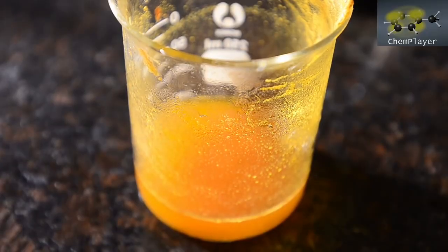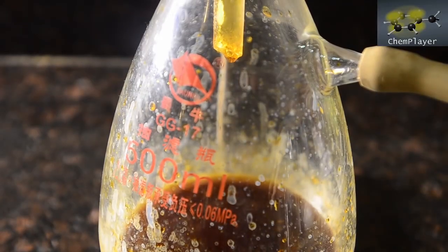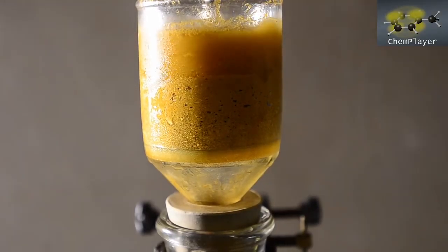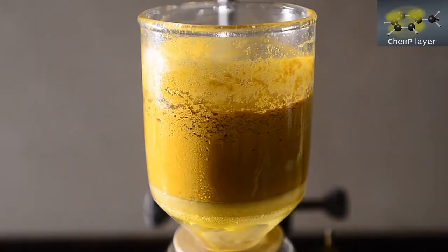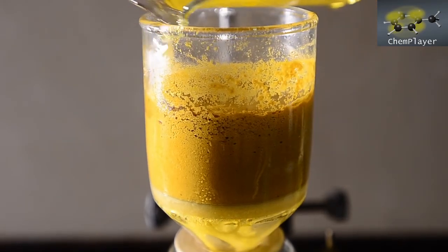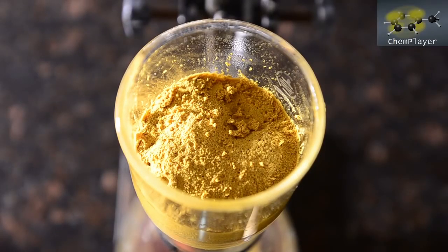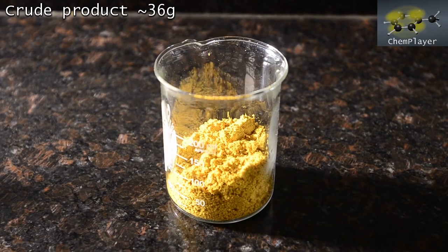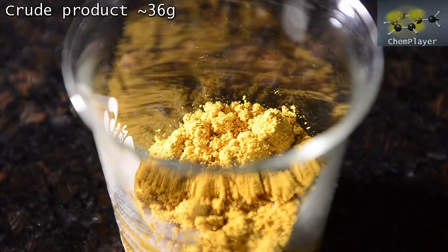We washed the beaker out with cold water, then washed the yellow solids carefully with cold water until the filtrate was only a pale yellow color. We then dried the solids as best we could on the pump. It's quite fluffy but not completely dry — 36 grams of yellow product. There's definitely some kind of weight gain as we'd expect from a nitration process, but we're going to have to purify this to see if we've actually got 5-nitrovanillin.